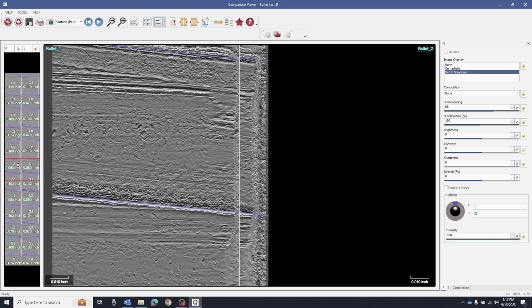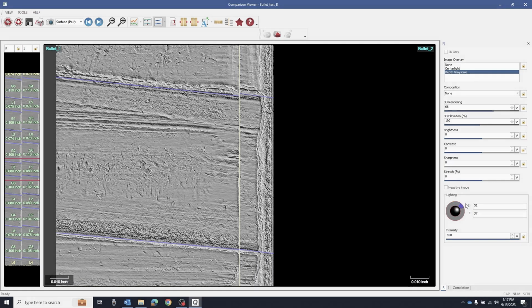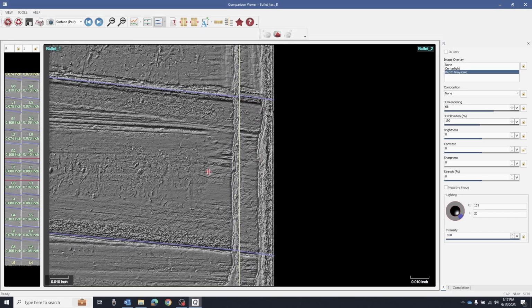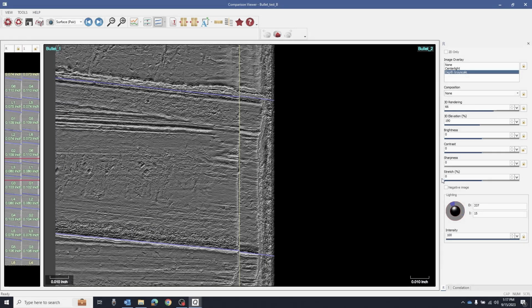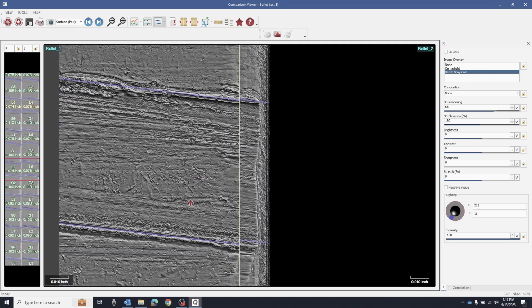Let's take a look at 3 to 1. Let's line up the shoulder up top. Some interesting things happening here, but again, huge features on the left side didn't happen on the right, and vice versa. Let's take a look at 2 to 6.